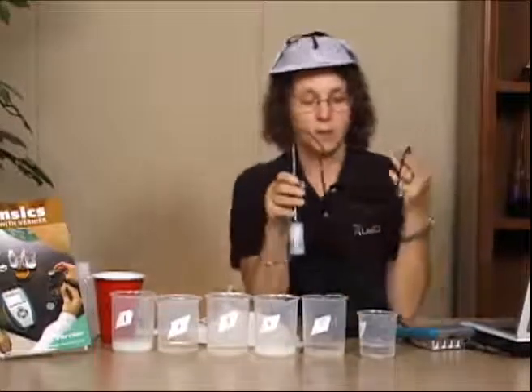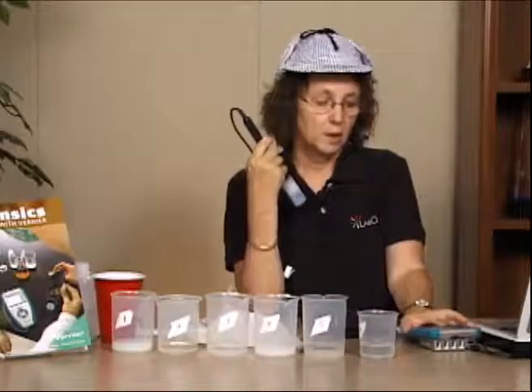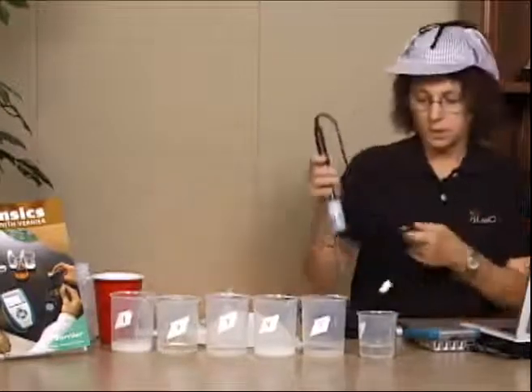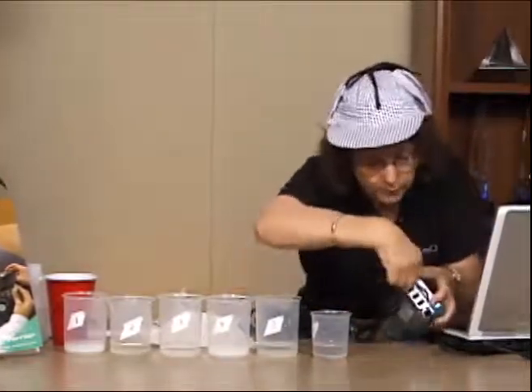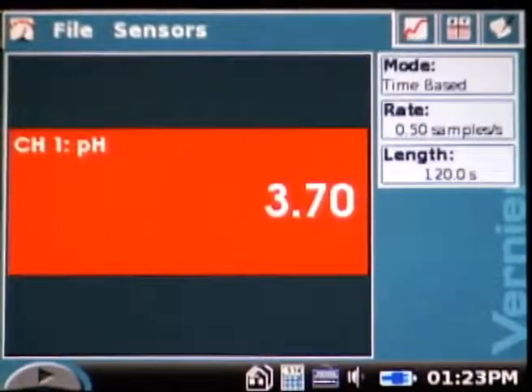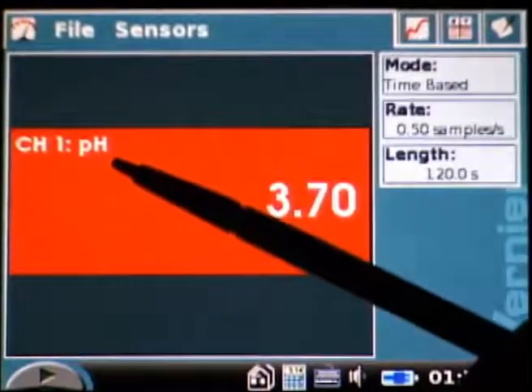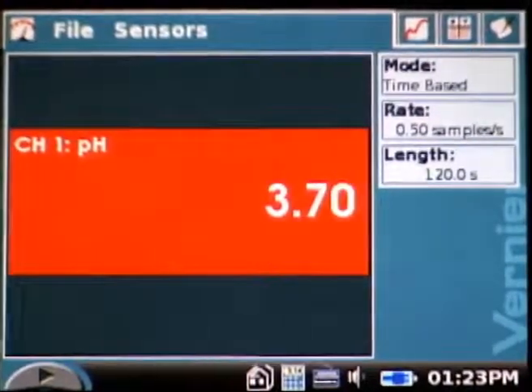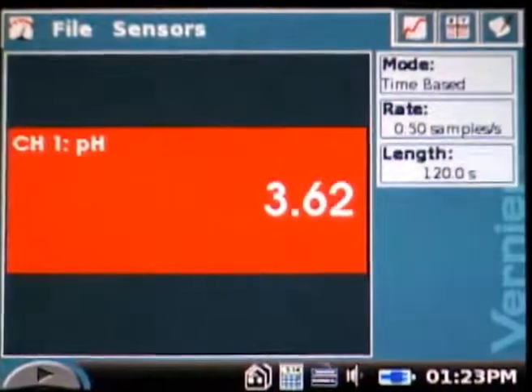The probe that we're going to be using first is the pH probe. We're going to plug it into an interface. In this case, I have the LabQuest, and the LabQuest is going into a laptop or a desktop computer. I just plug this right into 1 here. As you can see, we have the pH probe on the LabQuest, and it's plugged in. We can tell that because if we look at the screen here, we can see that it's auto-ID'd the pH probe. This is the meter screen. It will just come up that way for you. It's reading the pH of a solution right now. I'm going to rinse that off and put it into solution 1.